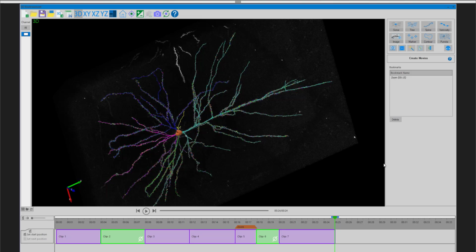I believe I answered the formatting question, but yeah, the resolution is going to be saved to the dimensions that you specify, whether it's the three-dimensional environment or that HD resolution, and it's going to be in that MP4 format.